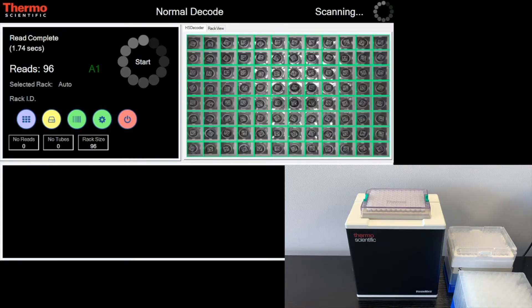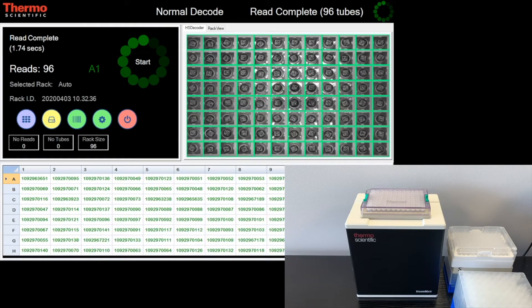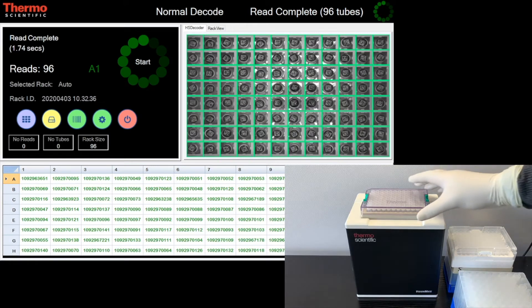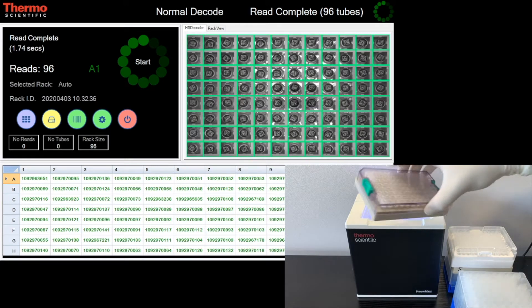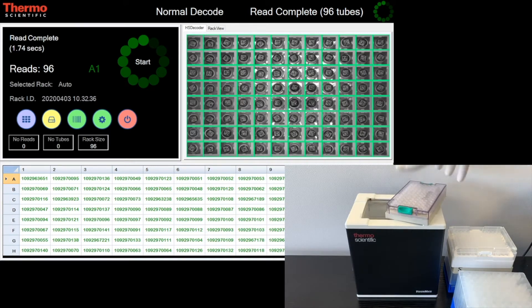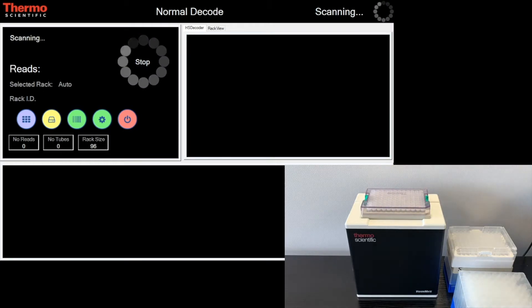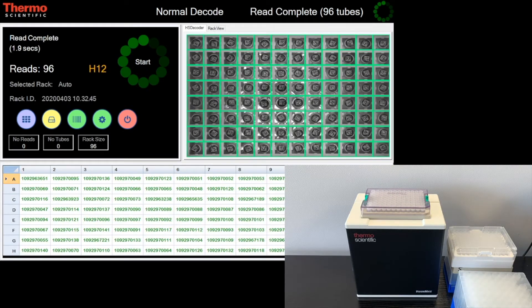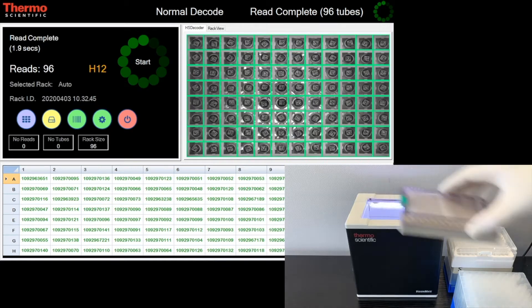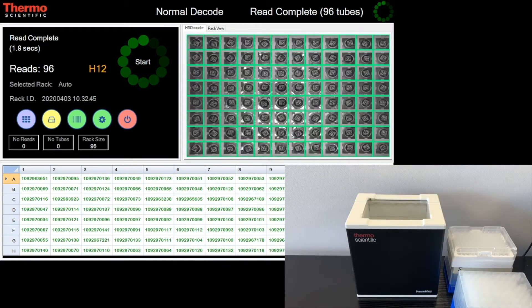Here we have a demonstration of the Visionmate high-speed scanner. Fast and accurate sample tracking, reading small 2D barcodes on the base of the test tubes and processing scans in a few seconds.